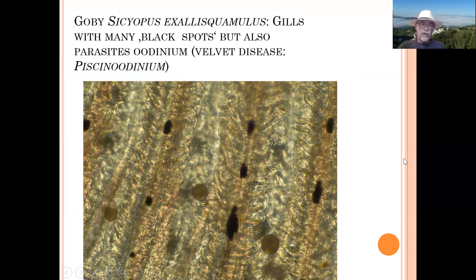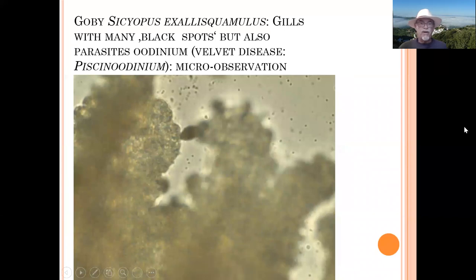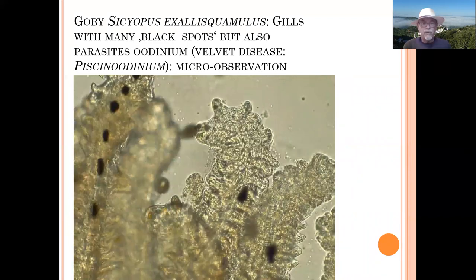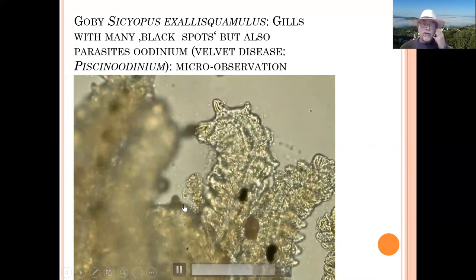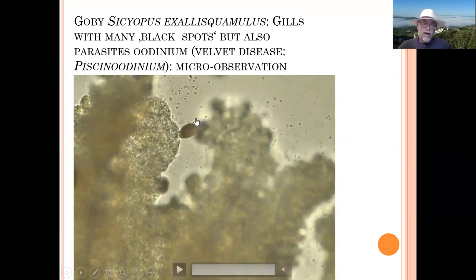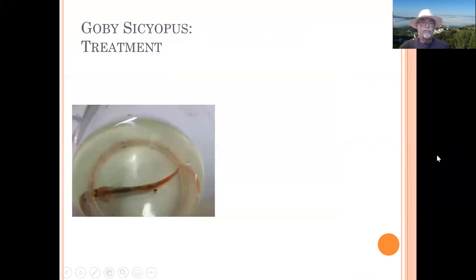The parasites are these unicellular microorganisms — one, two, three, four — we see here. It's called Oodinium, also known as velvet disease. The scientific name for freshwater fish is Piscinodinium. We see one sticking out here, and in the video I show my microscope observation. Moving the microscope lens, you can see the different spots all over, sitting on the gill filament, attached to the gill tissue and causing damage and risk of bacterial intrusion.